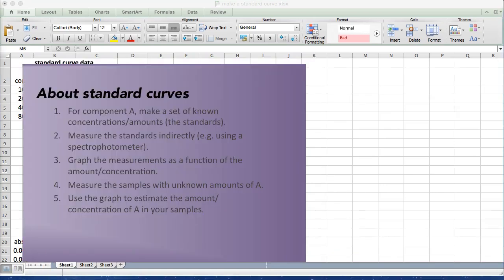Just a little bit about standard curves if this is your first time using one. Generally for standard curves you have some component, we'll call it A, and you're going to make a set of standards that you know the concentration or amounts of A in.